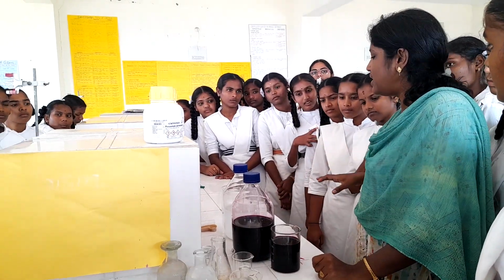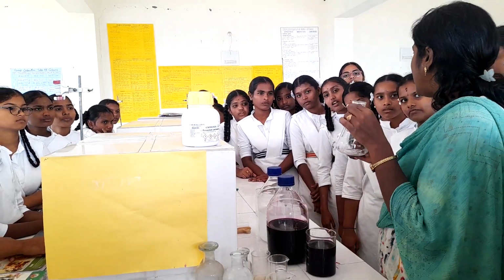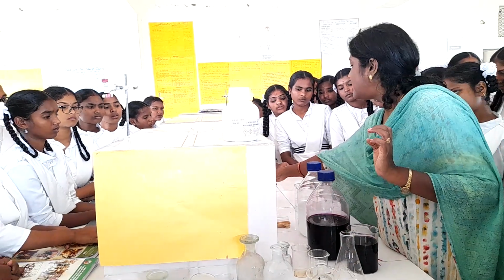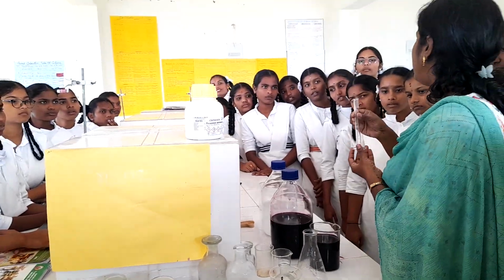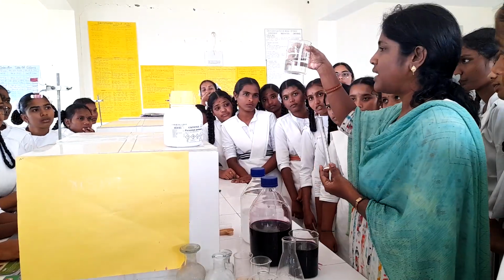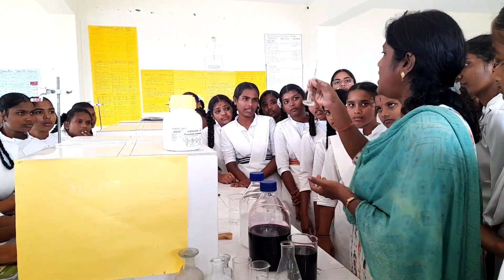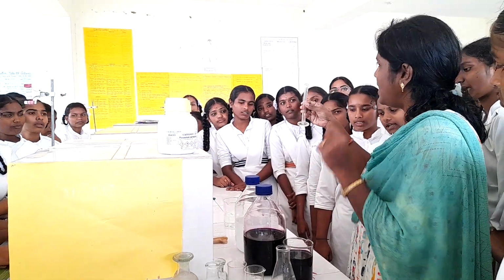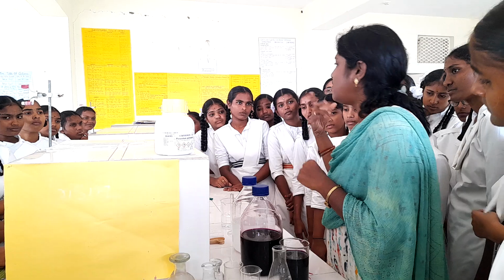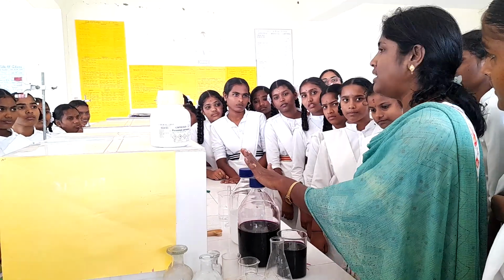But in this particular titration, after taking 20 ml of oxalic acid into the conical flask, immediately you are supposed to add about 10 ml of dilute sulfuric acid, which has been provided to you. Am I clear? So 20 ml of oxalic acid plus 10 ml of dilute sulfuric acid must be added into the conical flask, and immediately you have to titrate it against potassium permanganate solution taken in the burette.